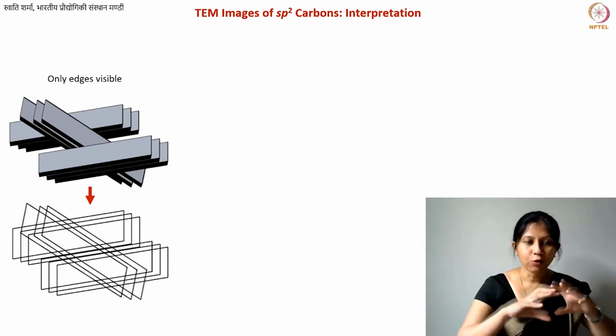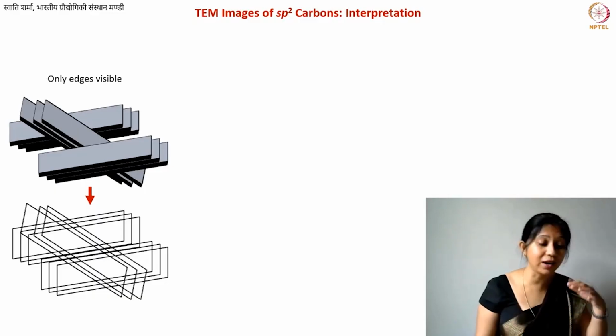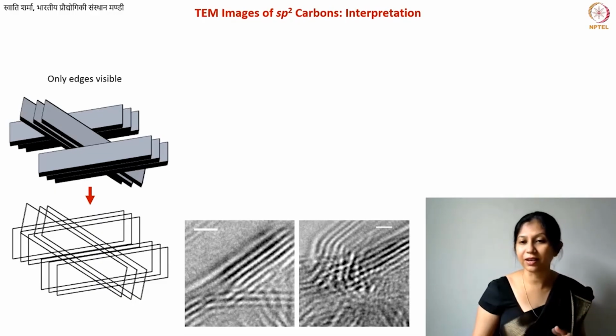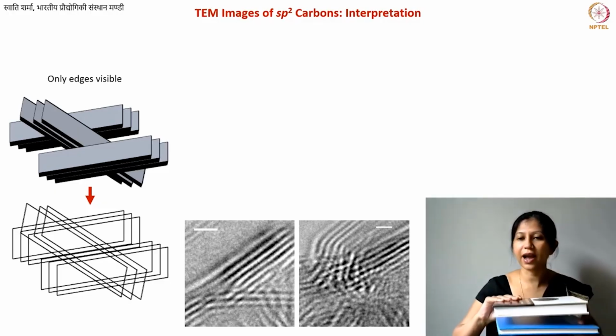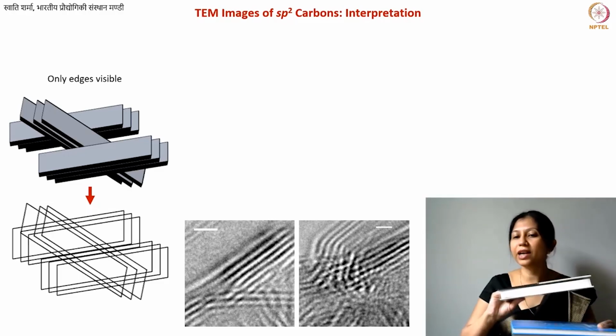If I just remove the solid part from this image and I just take the wireframe image of the exact same structure, then this is how it looks. Now you see it already looks so complicated. You will often see these kinds of things. These are actually real images, again from glass-like carbon. You often feel that your 2 planes are intersecting, while they are not. They can be far from each other, but they look like they're intersecting.